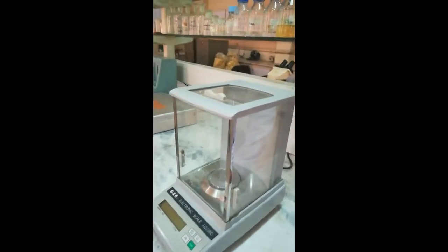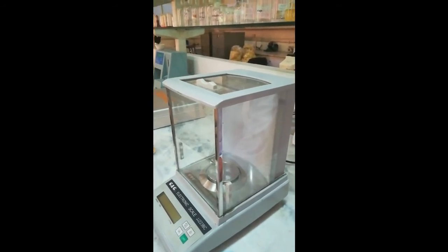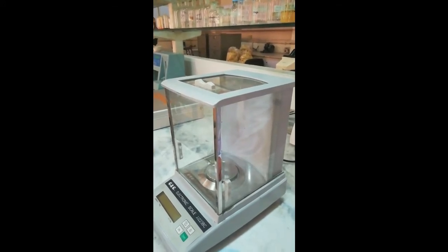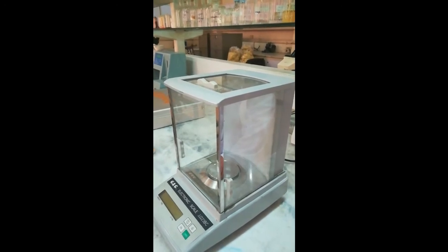Today we will discuss the first practical related to analysis of food products. We will introduce some equipment which is used for the analysis of food products.